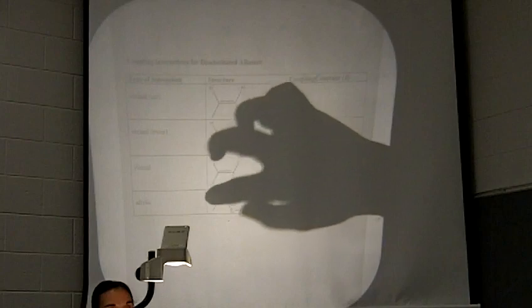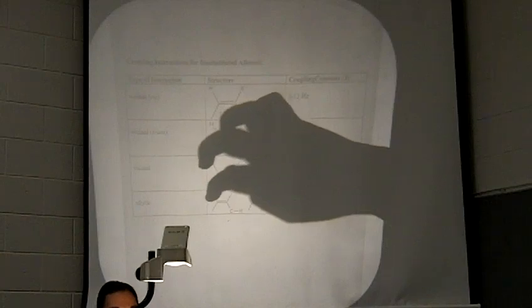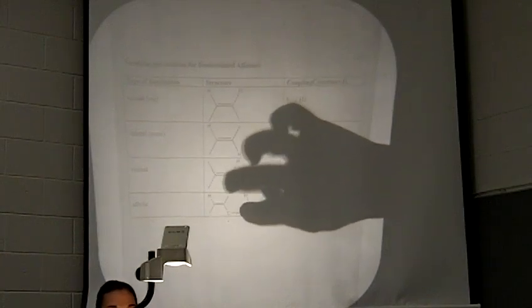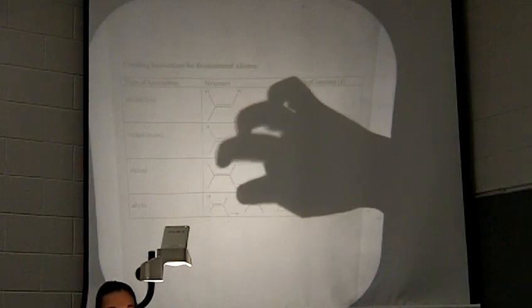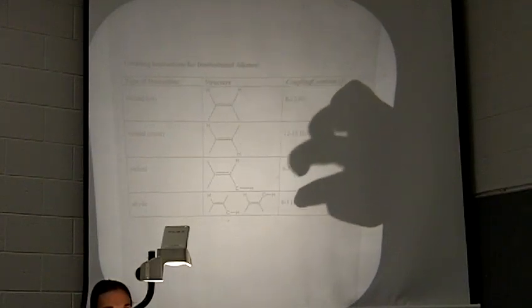Finally, the last relationship is allylic. We're looking at something three carbons away. Here's the proton we're interested in, then across the double bond we go 1, 2, 3. It's this proton here that can affect the coupling of this proton all the way over here. That's allylic, in either this direction or this direction. That's about 0 to 3 hertz, right?